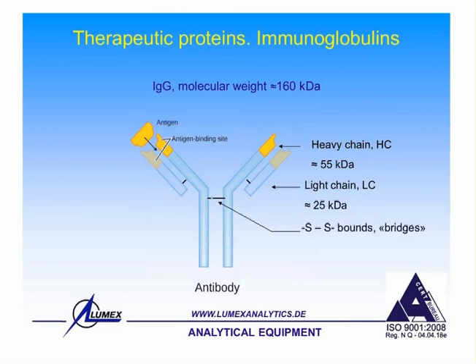We say that if we rinse the capillary with sodium hydroxide for a couple of minutes, and then with water for just 1-2 minutes, and then with running buffer for 2, 3, 5 minutes, we are on the safe side, and we manage to rinse the capillary completely. Indeed, such a way of rinsing helps in many cases.